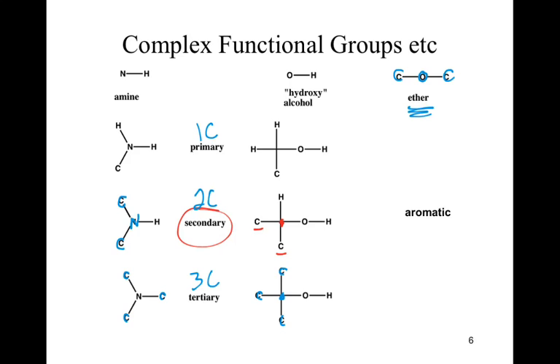Okay. Aromatic structure for some reason is not showing up, so we can draw that real quickly. What we're looking at with our aromatic is this system. We've got the formula C6H6. Remember all those implied hydrogens and carbons.